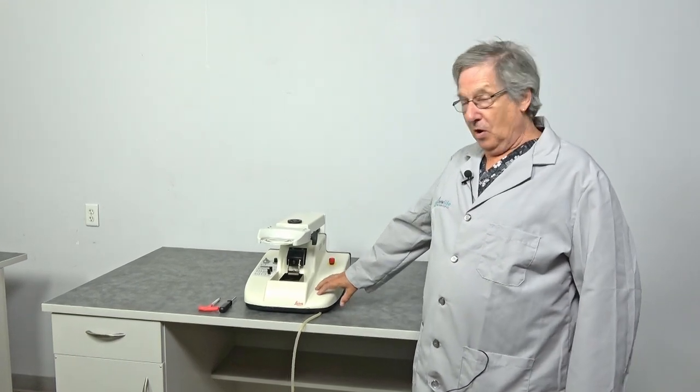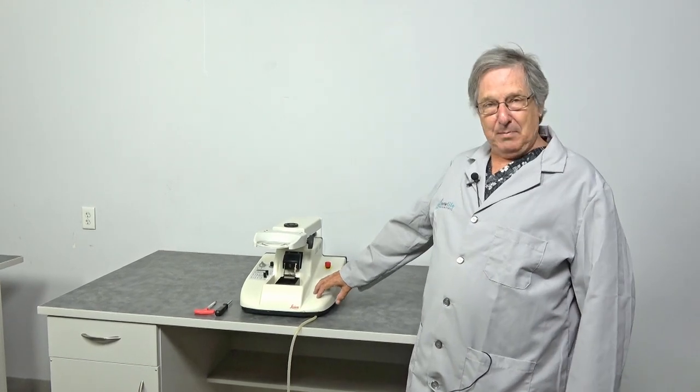Welcome to Live Scientific. My name is Steve. Today I'm going to be talking about the Leica VT1000S Vibrating Microtome.